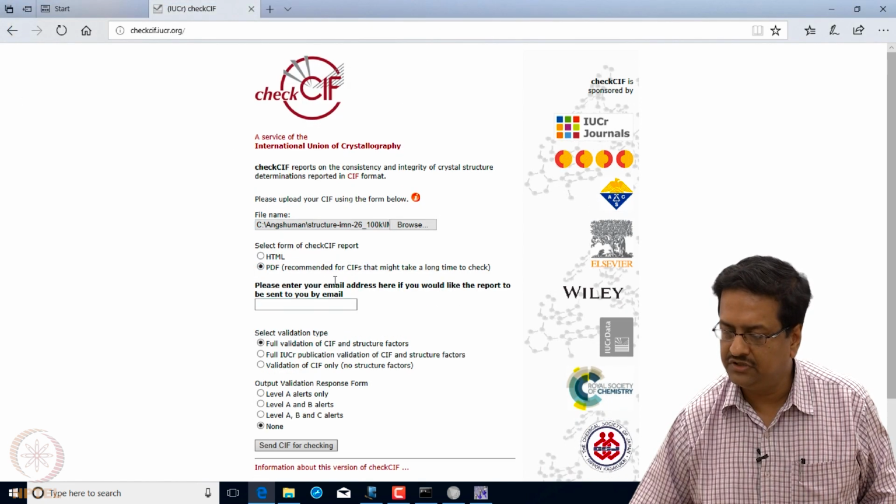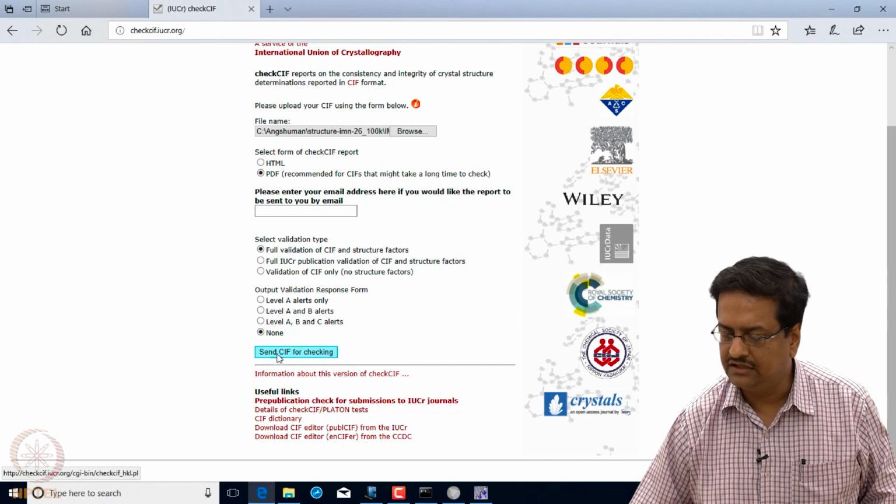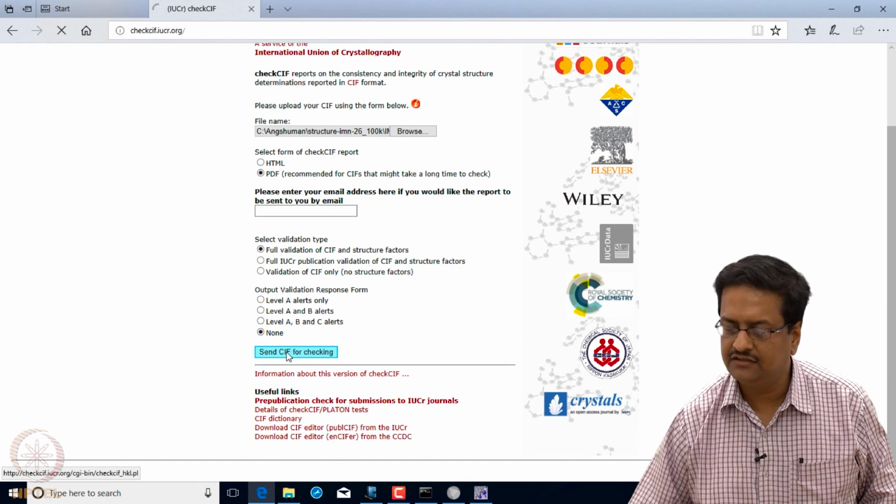We want the data in PDF format, and then we send it for checking.